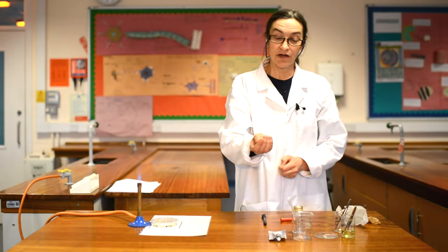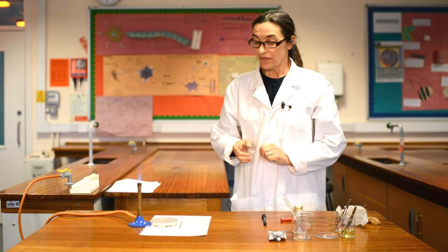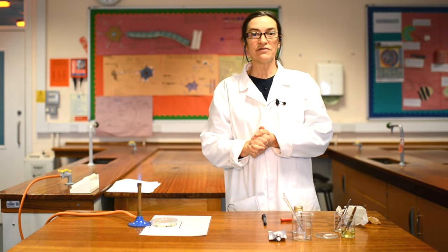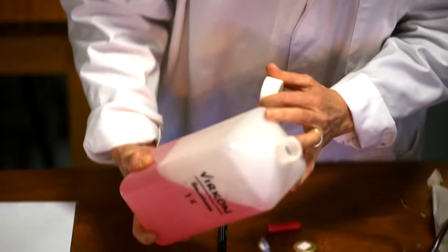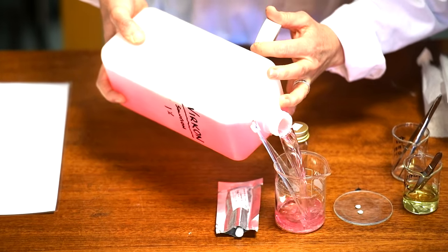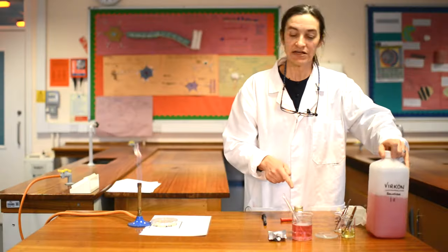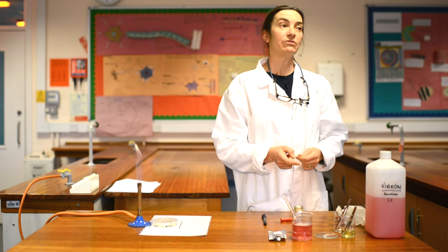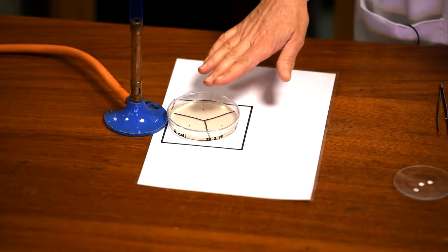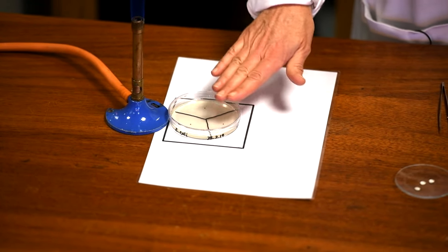The other thing we're going to know is whether you push too hard, because if you break the surface of the agar it's going to be very obvious. We want to make sure that none of the bacteria are going to survive. So I'm going to pour some Virkon into my beaker, and any bacteria left on the spreader or in the pipette — in 10 minutes, those bacteria will be killed.